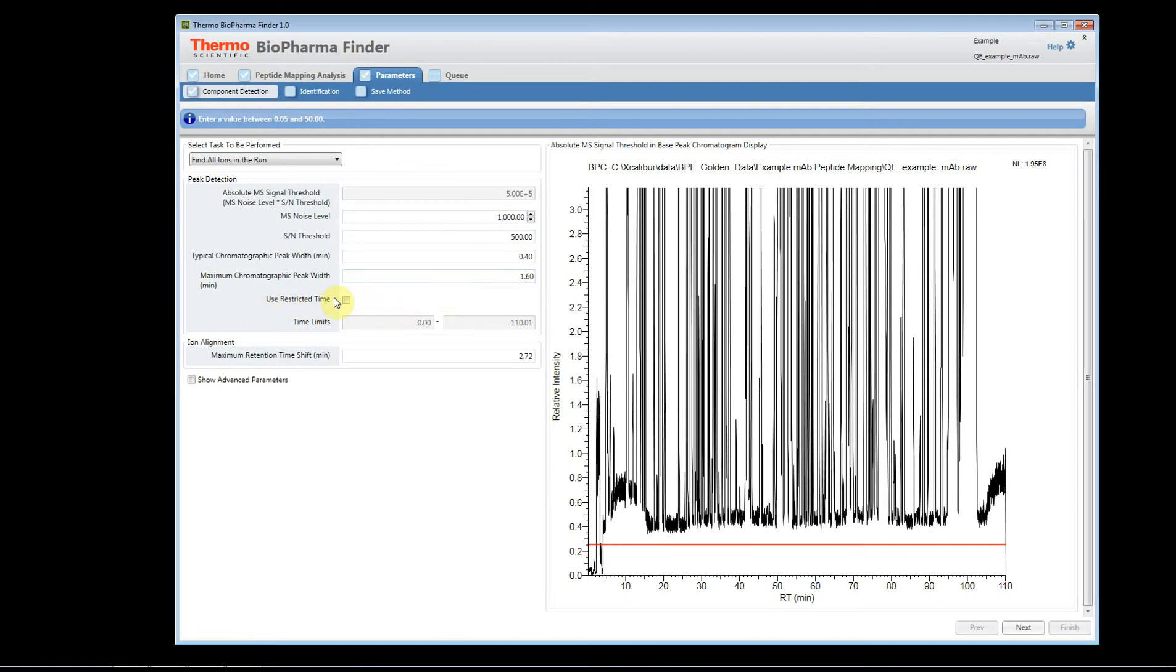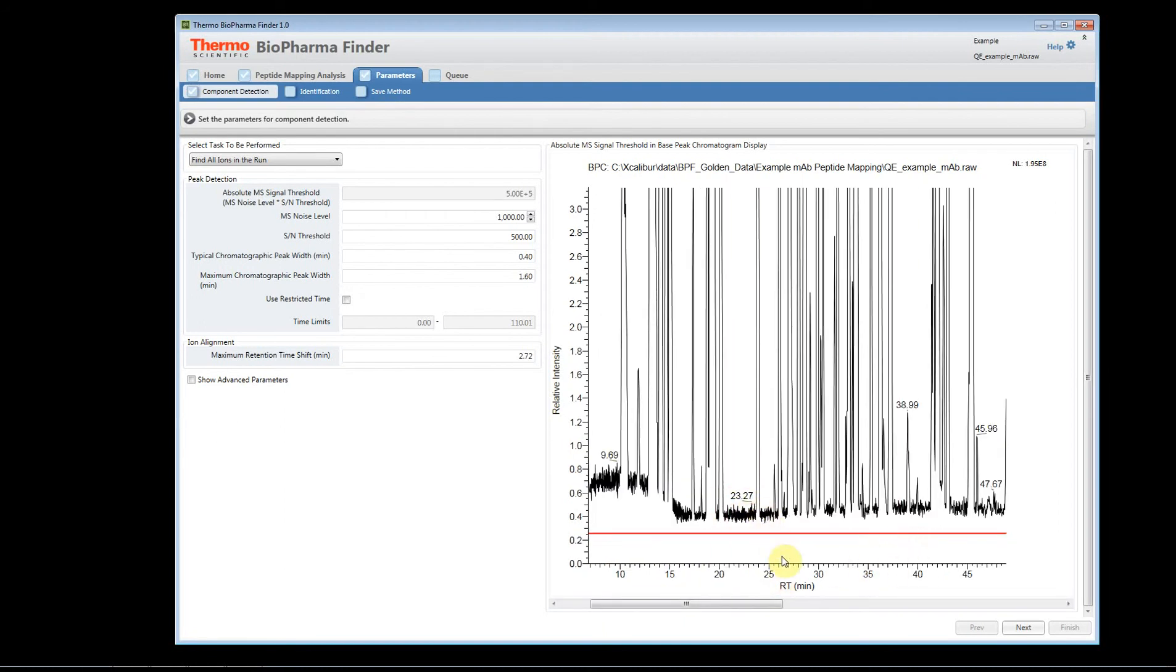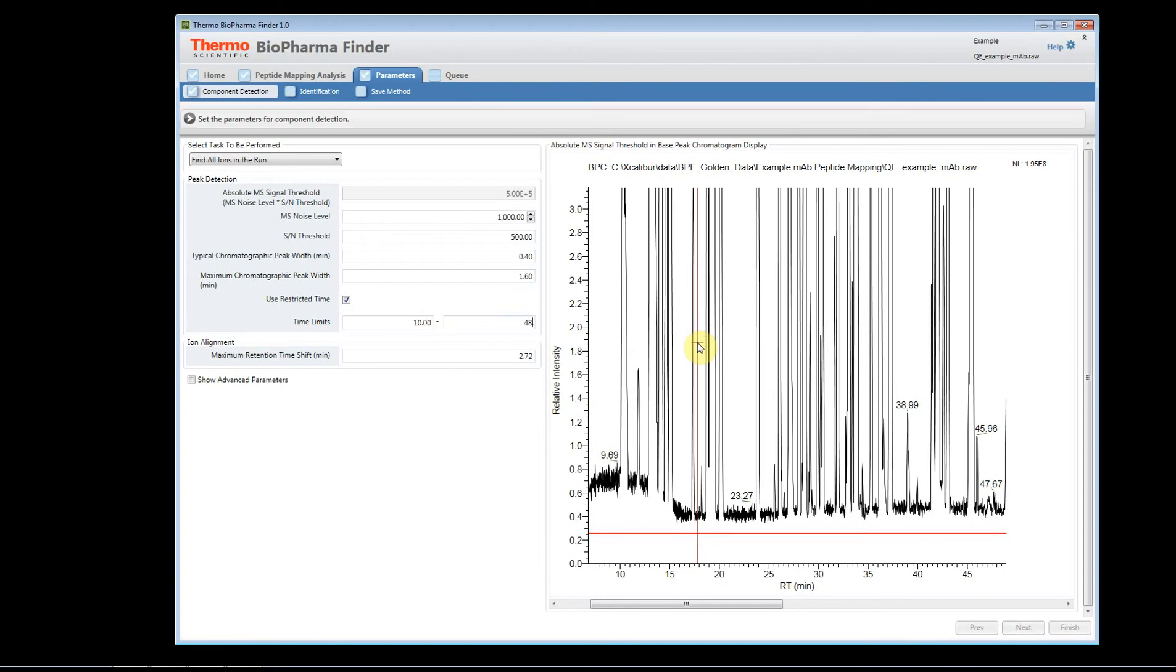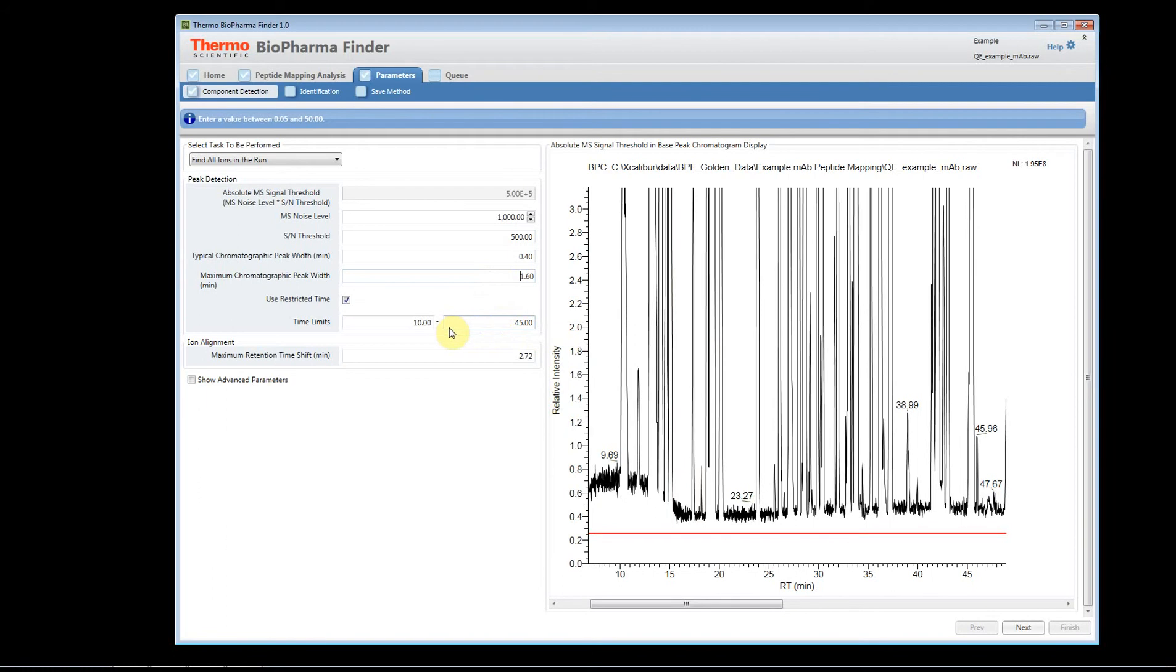You can also use restricted time range. Let's say that you're really only interested in those glycopeptides that are eluting between 10 and 40 minutes in your chromatogram. You know exactly where they elute. You know that this is what you really want to focus on. You can set a restricted time window. You can say only look at 10 to 45 minutes. This is a very nice feature because it can speed up the process. It can allow you to add more variable modifications. It can allow you to add, and it will speed up the search time. Another thing to think about when you're doing the processing.